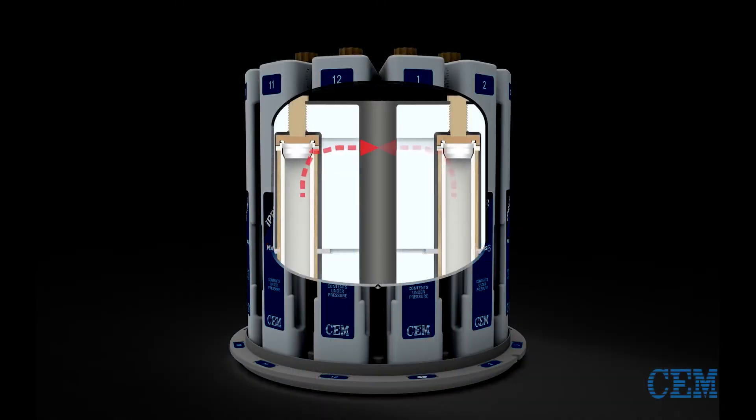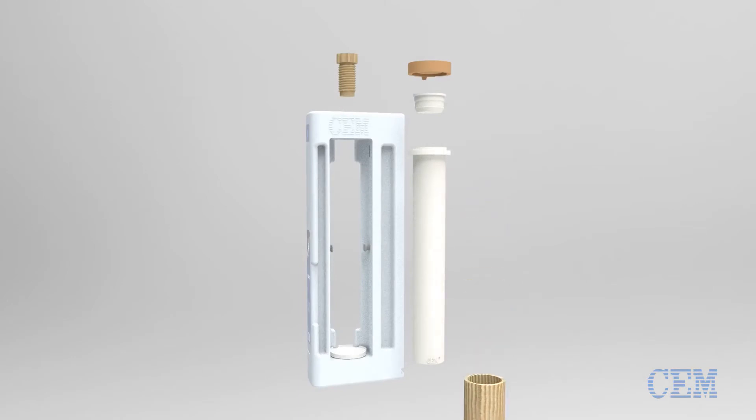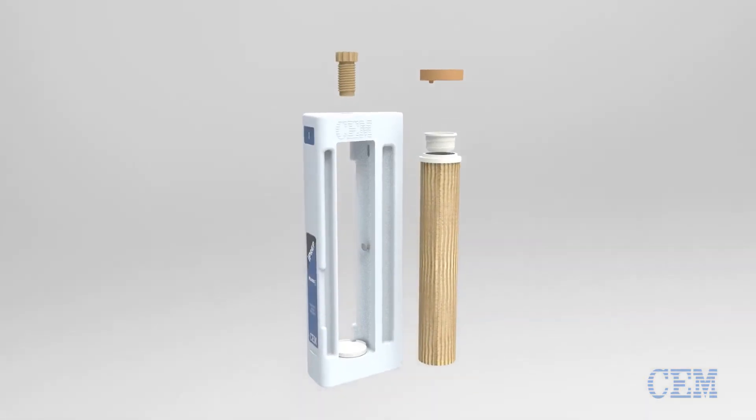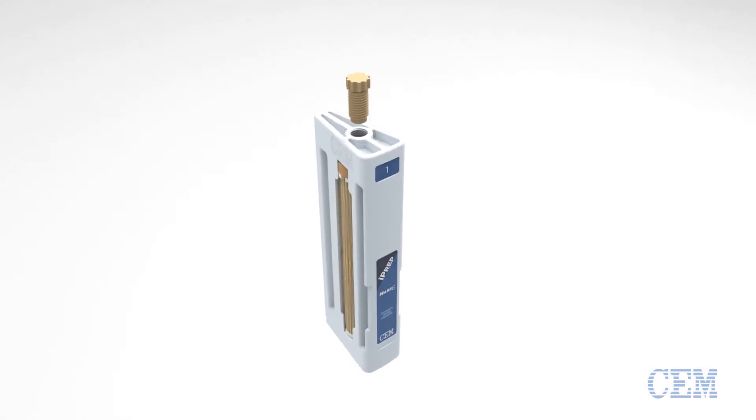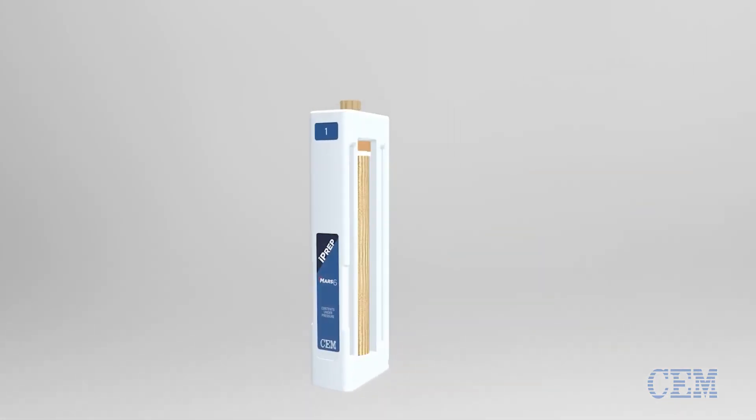The vessel is designed so that all gases are directionally vented through an aperture in the vessel and then out through the frame away from the user. The I-PREP vessel is easily assembled using only three components: the liner, the plug seal and a load disk. This assembly is placed into the composite sleeve and then into the frame.